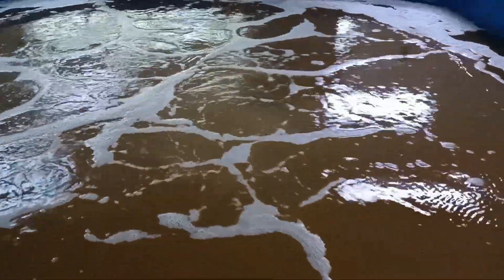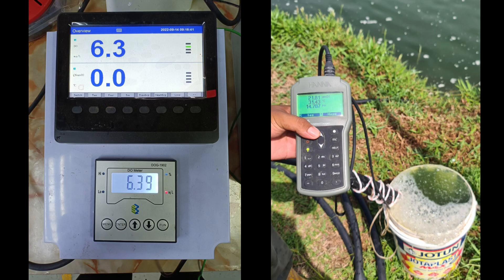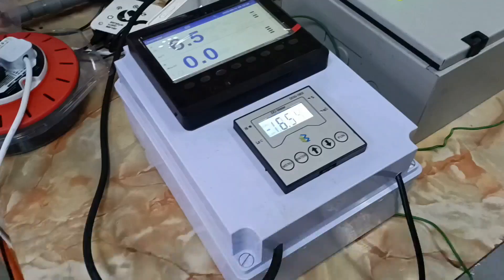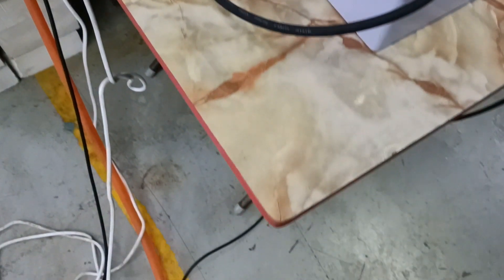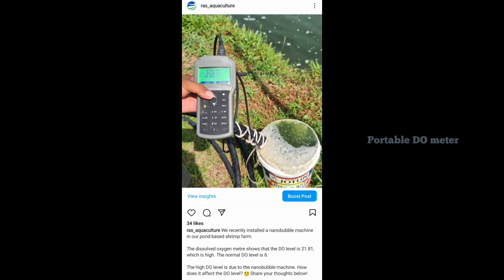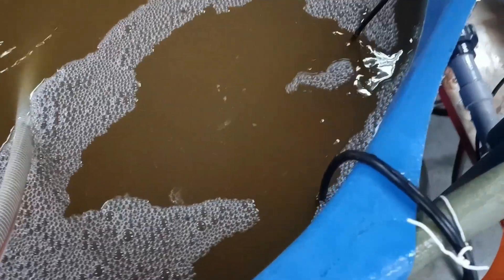Good day everyone! Do you have any idea what these are? That's right — these are dissolved oxygen meters. For our bioflux system, we recently used a different type of dissolved oxygen meter. If you follow us on Instagram, you will know that at our outdoor shrimp farm we use a portable dissolved oxygen meter. Do you want to learn more about the new DO meter? Keep on watching!